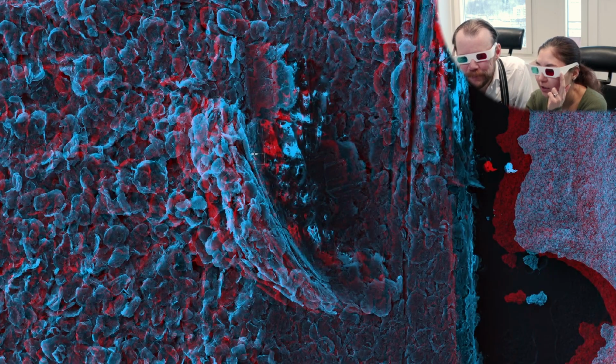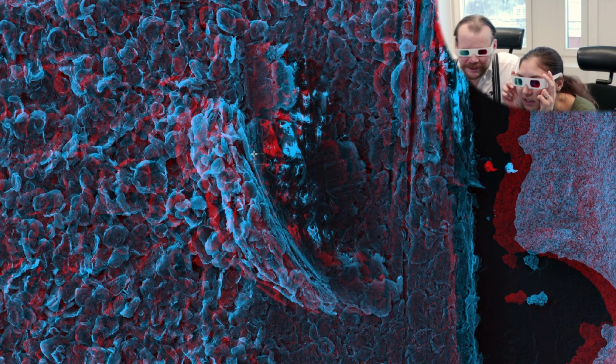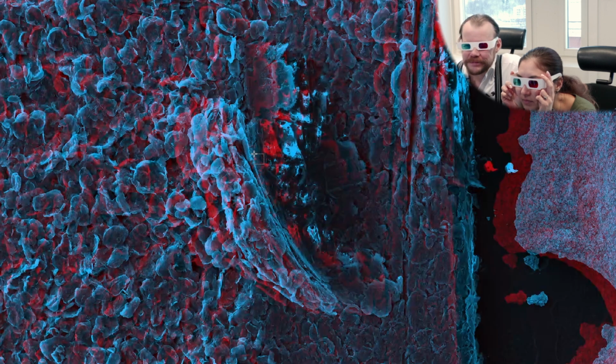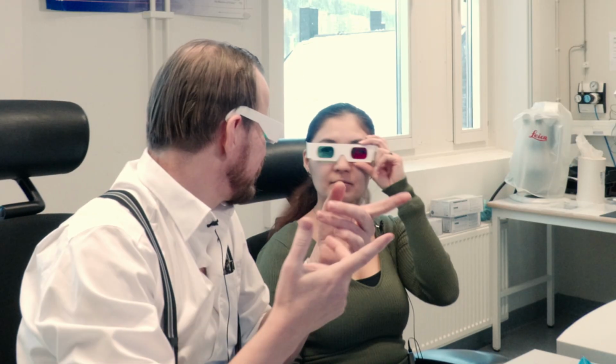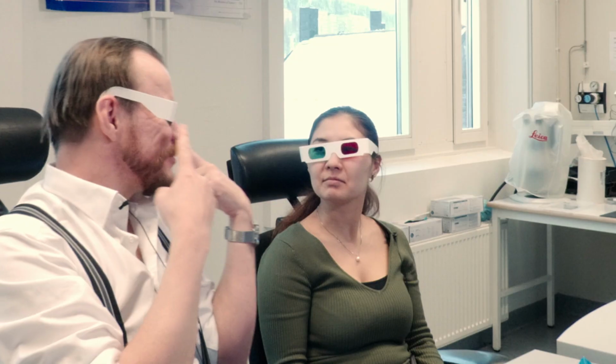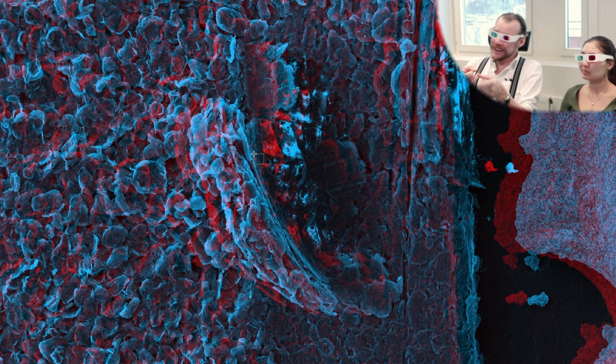Was it when you untouched the electrode? Yeah, that is the front of the tweezer. That has been pressing into the graphite, and then we see it folded up, so we scratched it down and compressed it. And the nice thing with this is that the viewers on this YouTube thing can use the fancy glasses and see the same thing as we see now. That's the cool thing with this. Awesome.